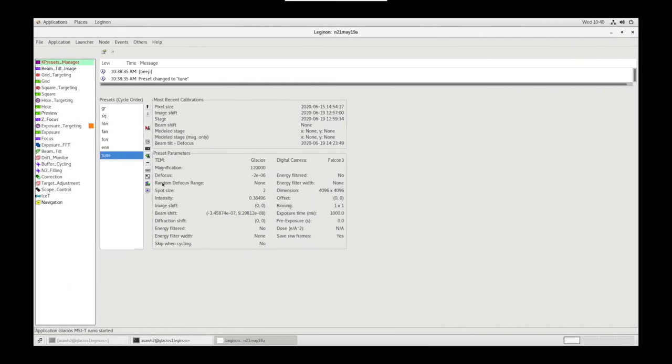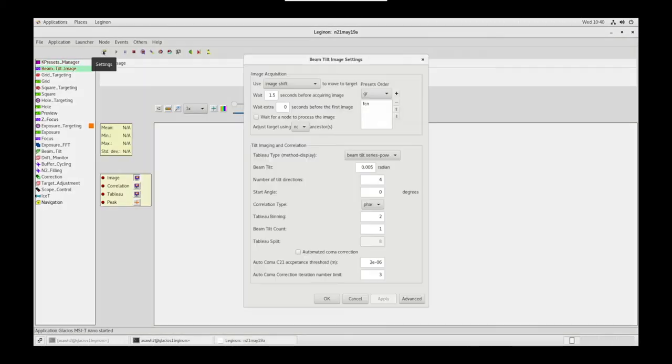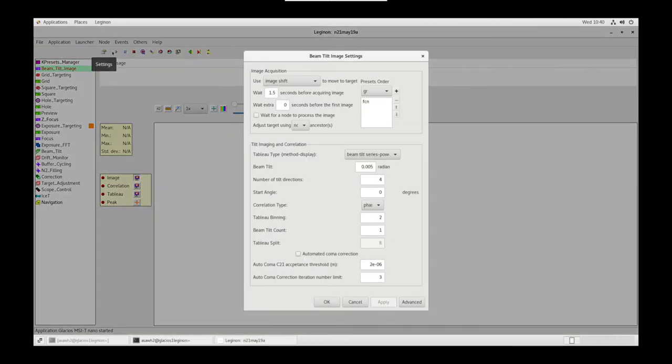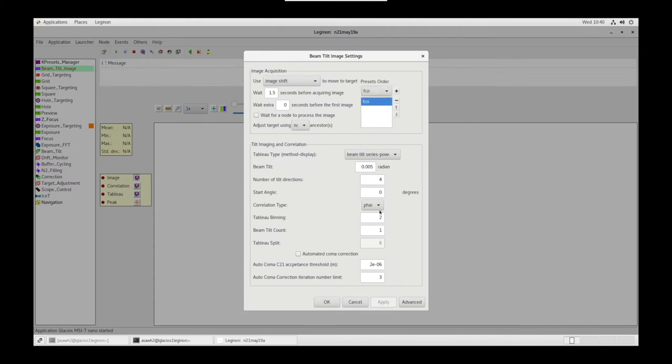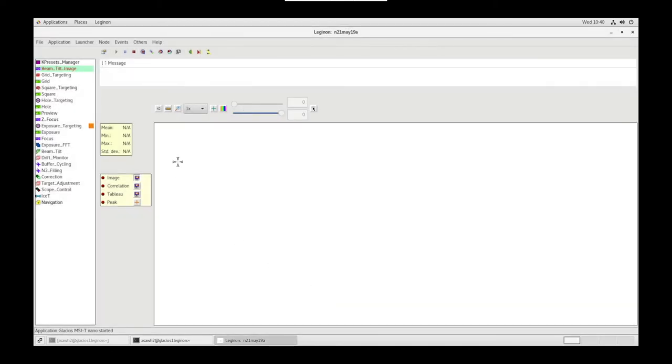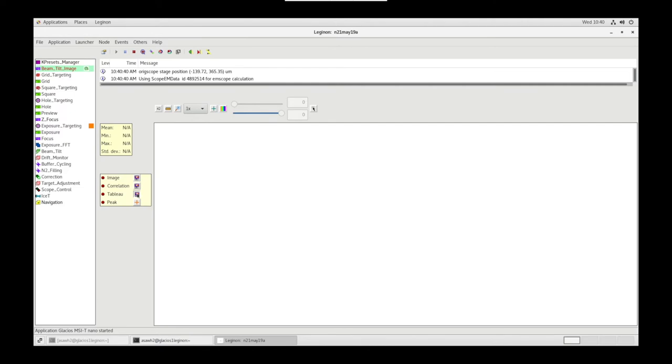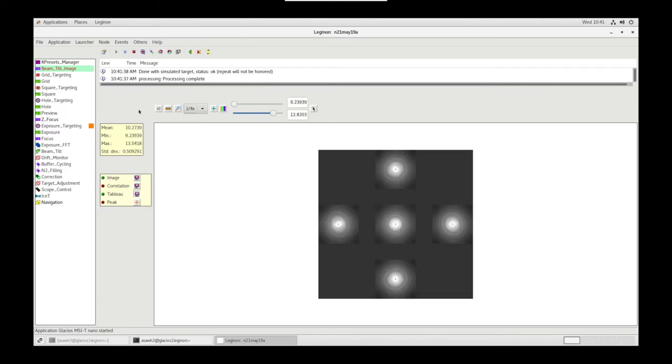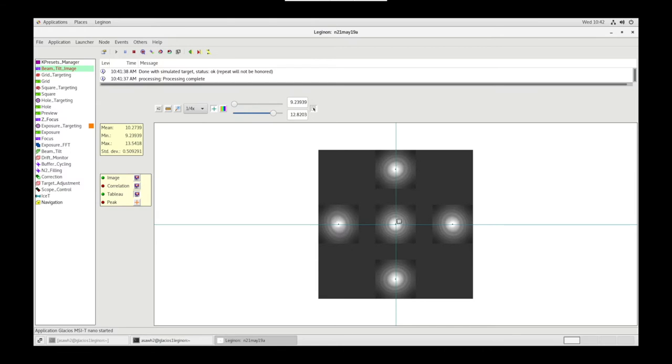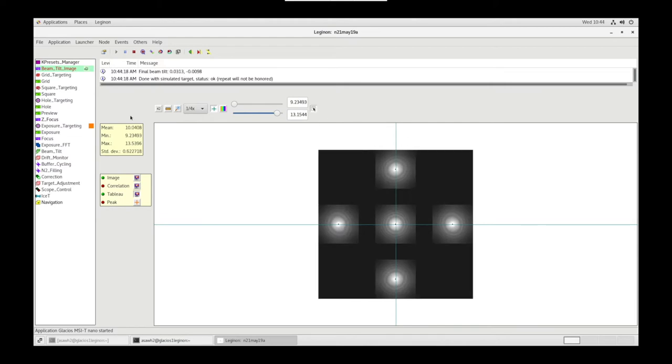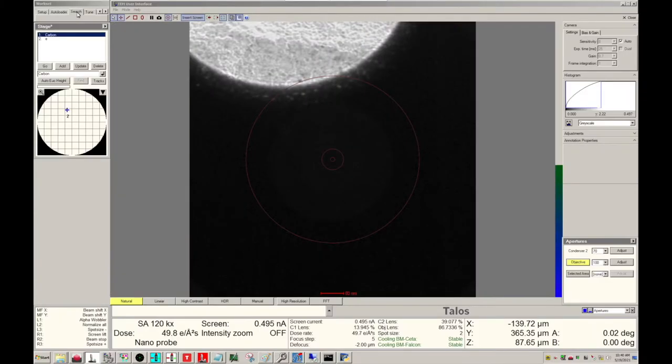Back on the Legenon PC, let's go to Beam Tilt Image. Let's make sure settings are correct. Preset order needs to be FCN. Okay. Now let's simulate a target. Set View to Tab Blue. Zoom out to 1/4 mag. We want the left and right and top and bottom FFTs to be identical. Use the crosshairs to view your center. If the images are not the same, use the Cursor tool to click on the center FFT in the direction of the better image to fix the dissimilar image. Once fixed, let's go to the Search tab, click Vacuum, and Go.